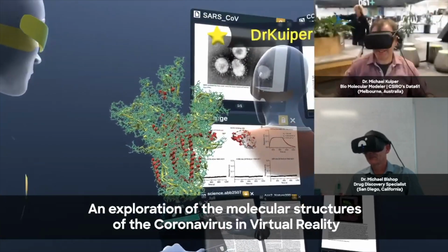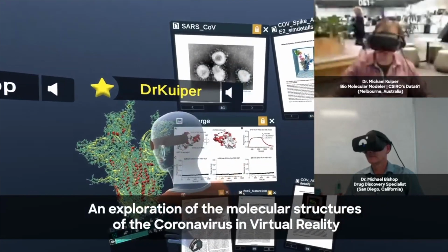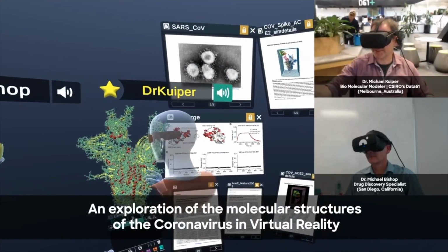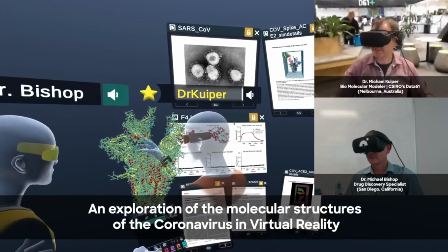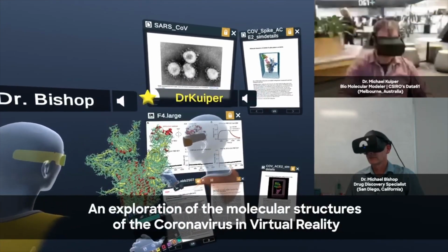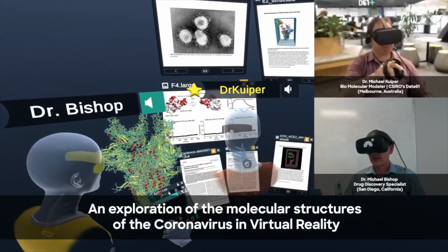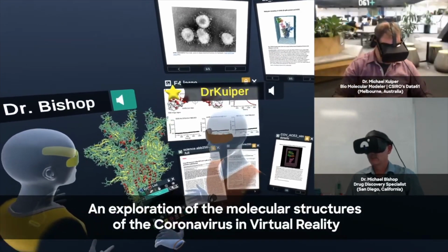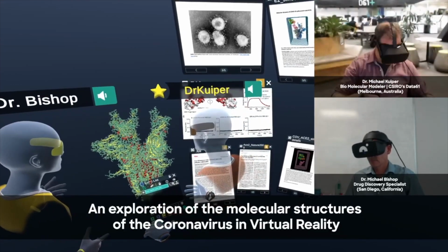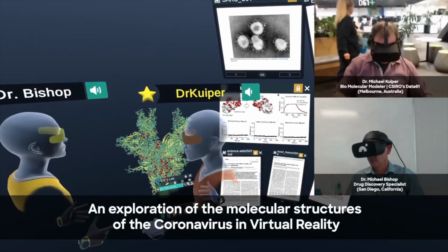So here we have an image from their paper in Science yesterday, which highlights the differences of the binding surface. In fact, what we can do now is bring up their structure and compare it to the model we made. Oh, that'd be fantastic. Let's do it. Okay, I'm going to delete this structure as well, just so we don't have the lag issues.